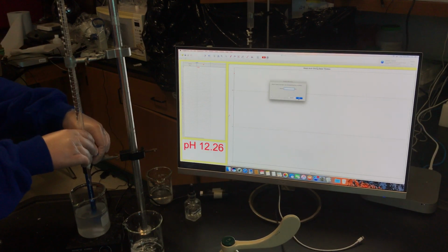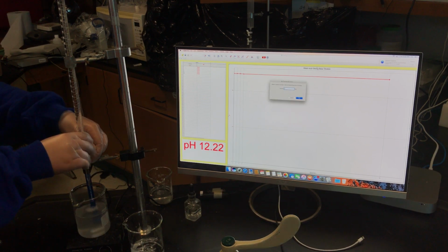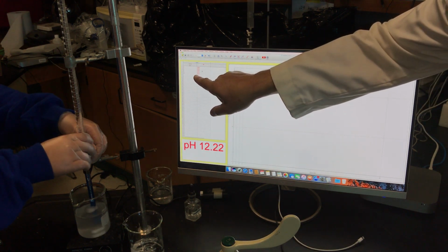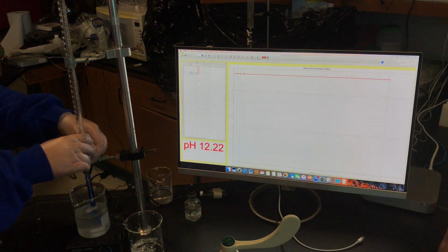One. And let student L know you've done that. Good. And keep going. And this is what's going to tell us our equivalence volume. Oh gosh, I wrote 44. I just changed that. Hold on. Just type it over here. Don't add any more. Hit cancel. Okay. Type this number over here as number 4. Go backspace. Enter. Good. 10.